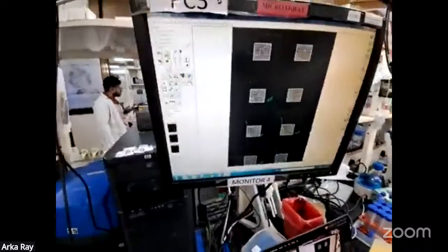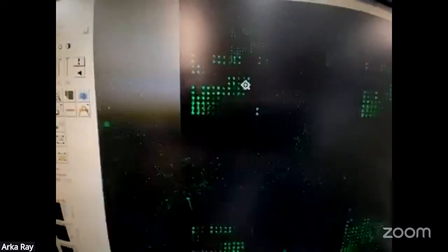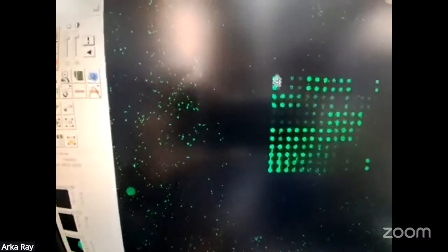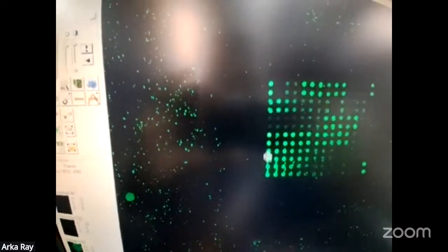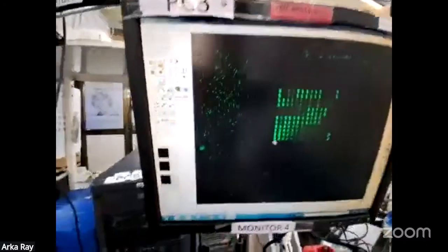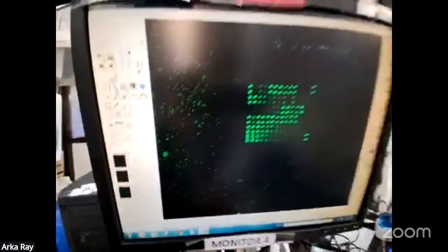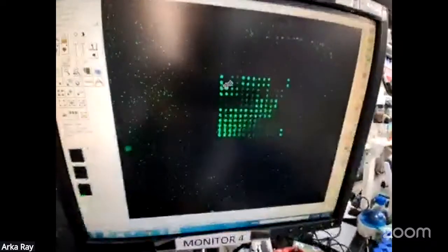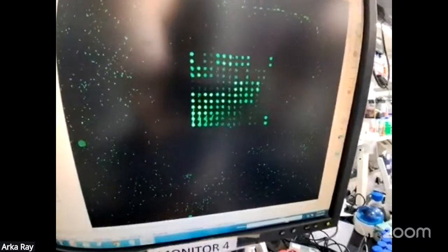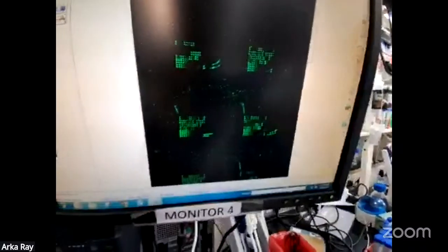So this is the protein array image. I think you can see, as I mentioned, these are the duplicate spots. These are printed in duplicates. I already told you about the QC steps. The next step is definitely the gal file. So now I'll go directly to this one.